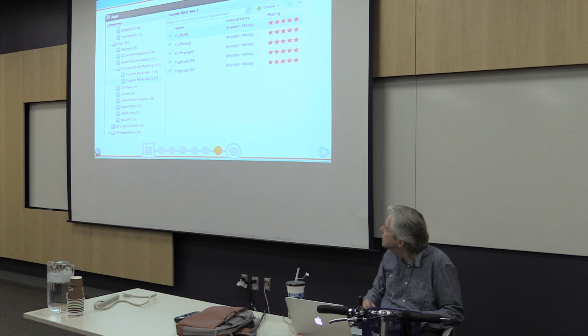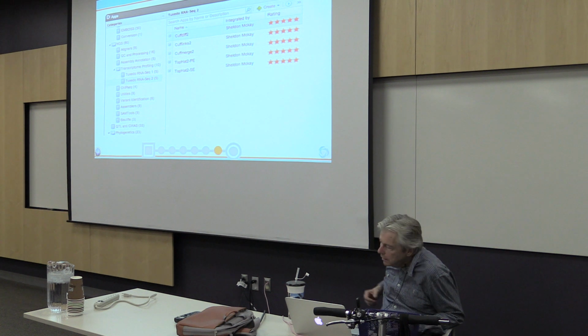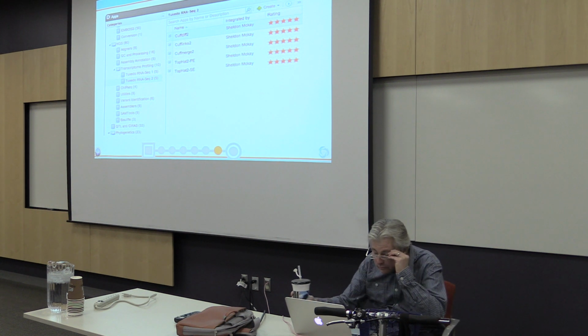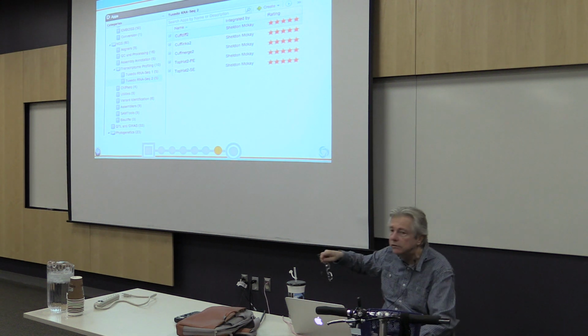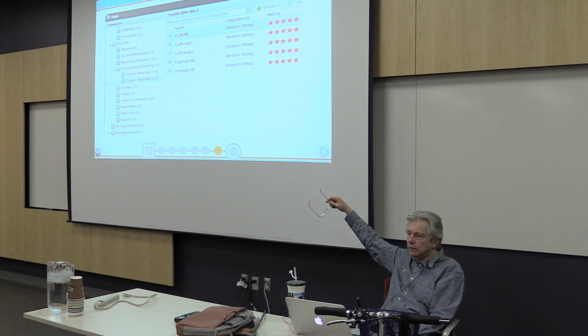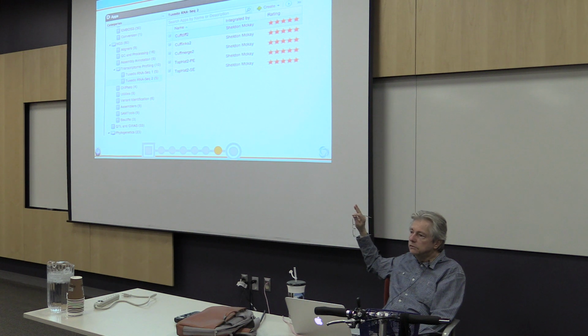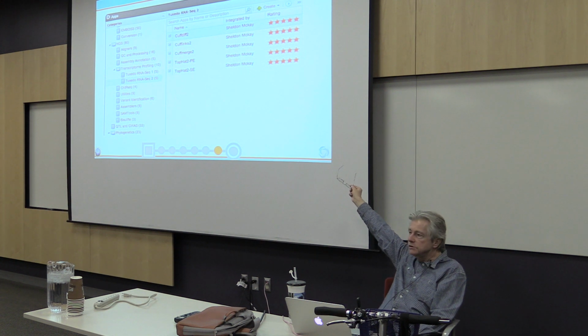So I think we've covered enough of that. So if you look in the discovery environment, and many of you, I assume, already have your username, you'll probably want to log into the discovery environment at this point. Hopefully you can. And if you look under the various categories as they're currently set up, there's a section that's called Tuxedo RNA-seq 2, the version 2 of the newest applications, and they're better, they're faster, a little more sophisticated. And you have this list of applications there.